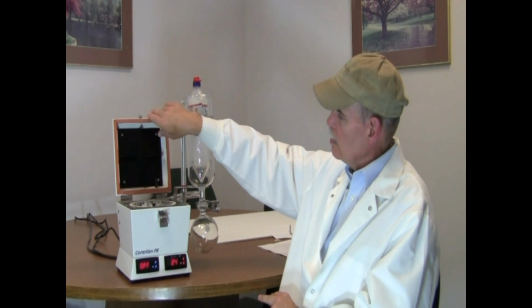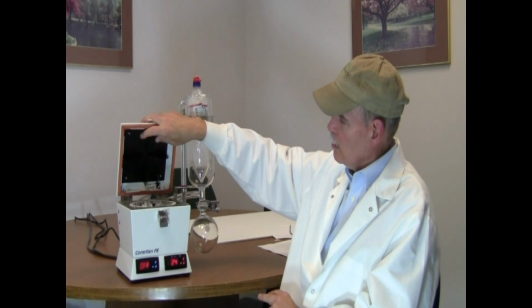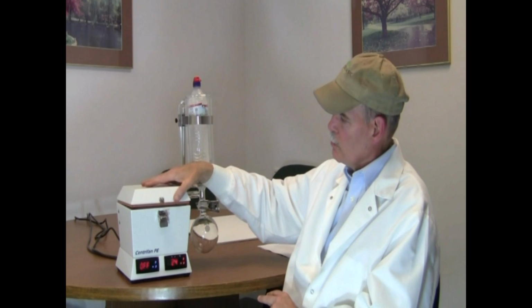There's a temperature sensor here, and by driving the increase in the temperature of the heat sink, it basically warms the gas flow that is recirculating inside and hits the set point. This will shut off the heater and basically servos at that point.